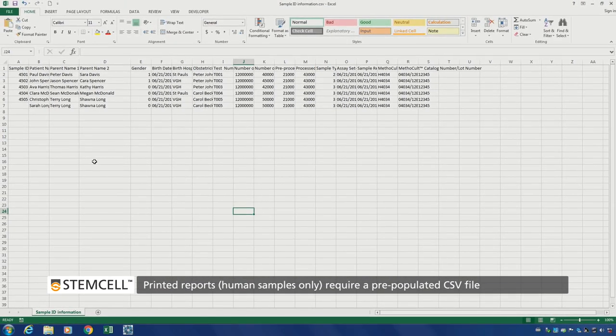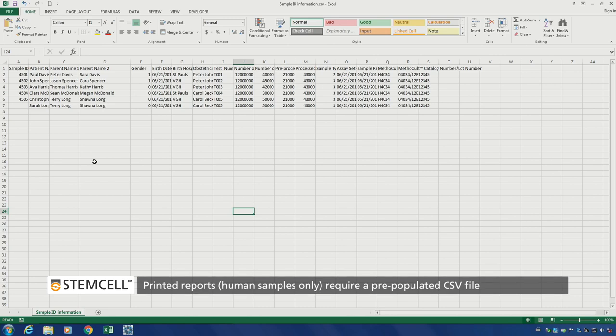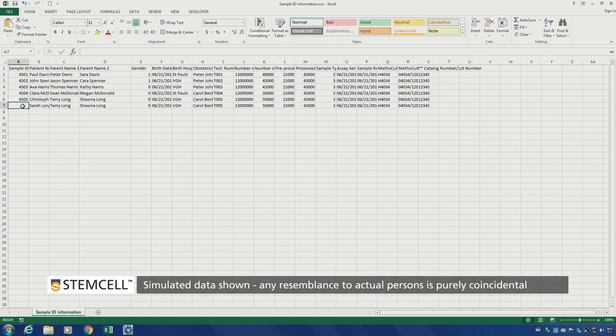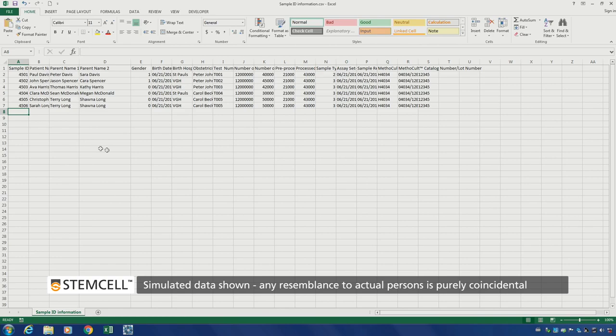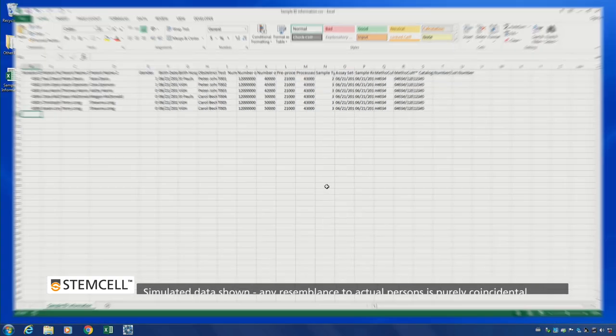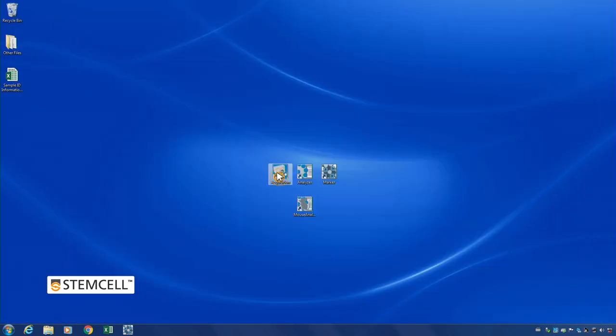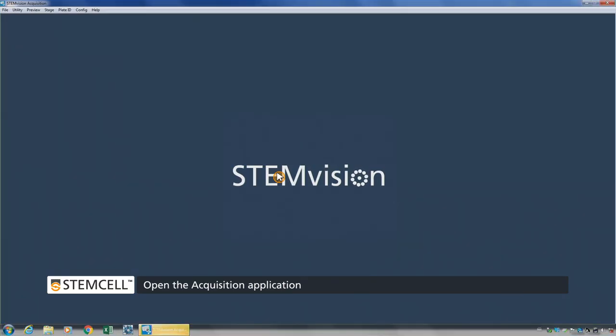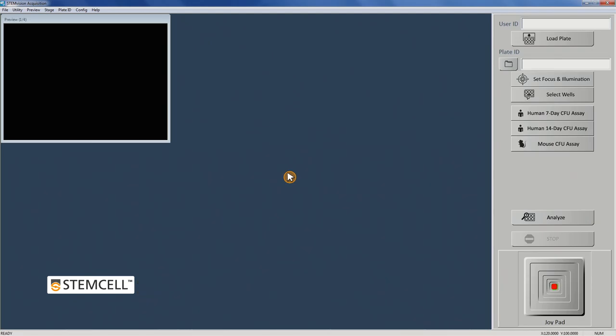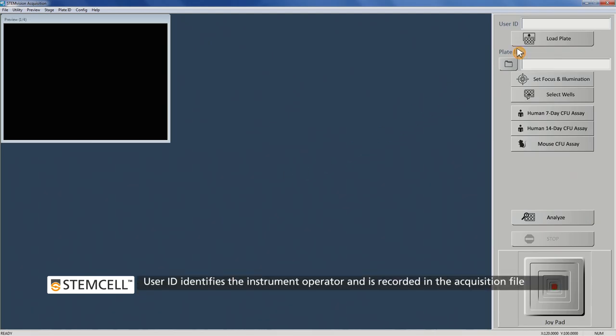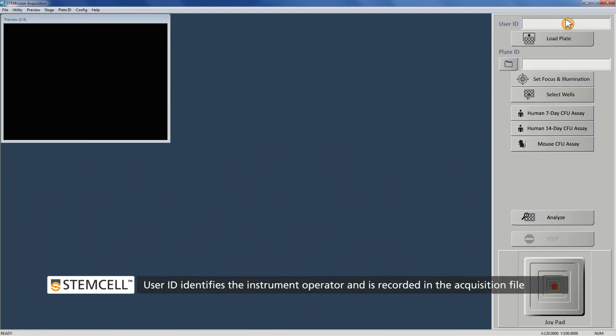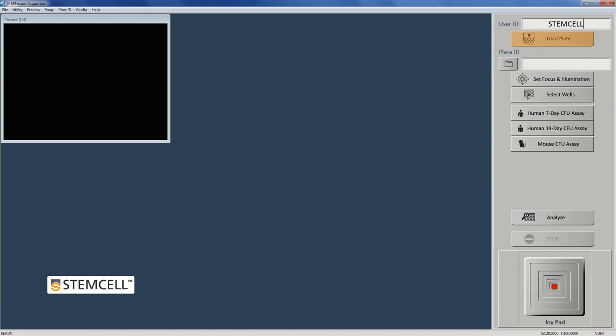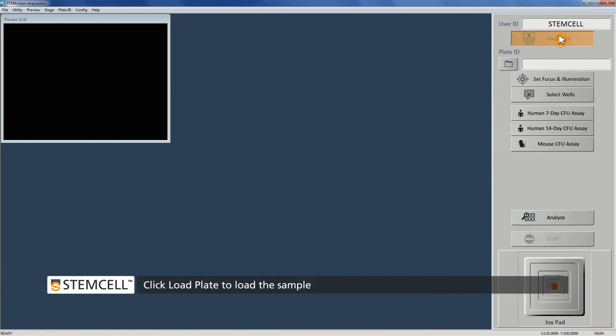A sample ID for each well is required for tracking and report generation. These can be entered through bulk upload using a CSV file saved to your computer or added manually at a later time. To start a run, open the Acquisition application. Complete the User ID field if needed. Then click Load Plate to load your sample.